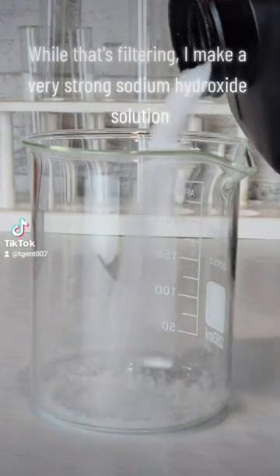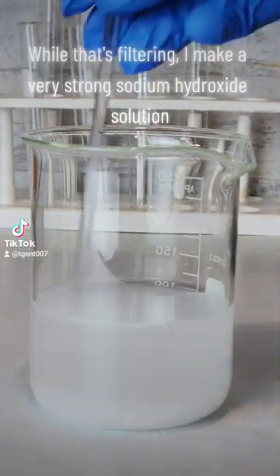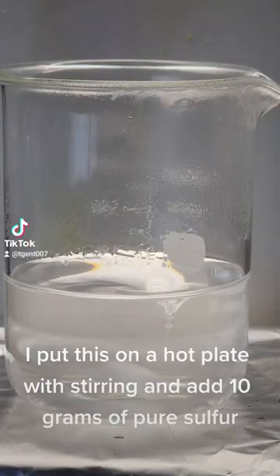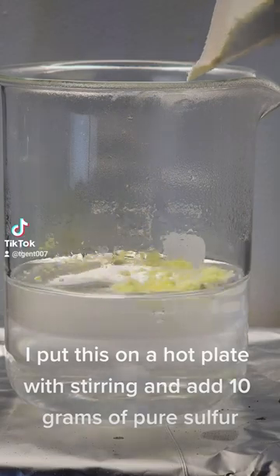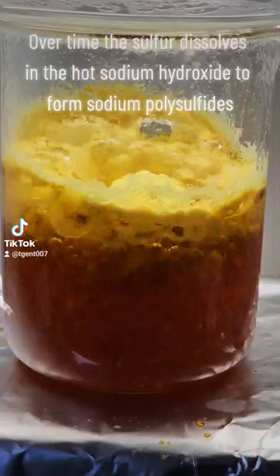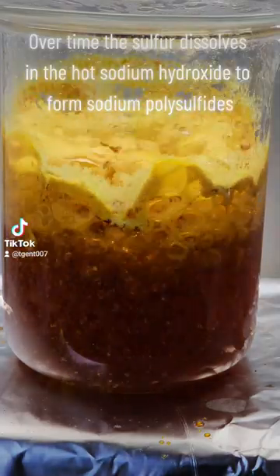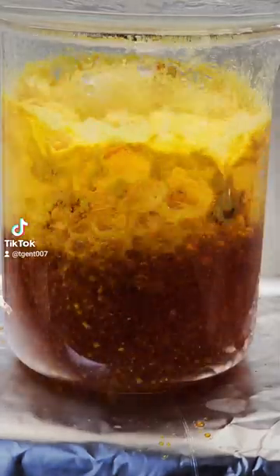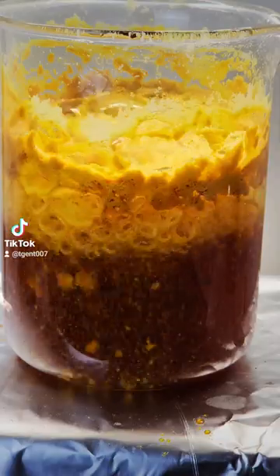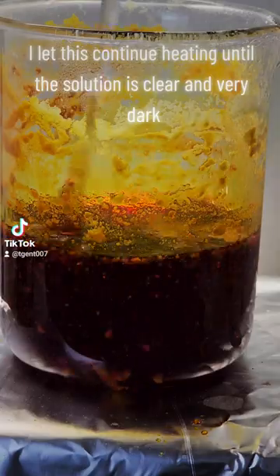While that's filtering, I make a very strong sodium hydroxide solution. I put this on a hot plate with stirring and add 10 grams of pure sulfur. Over time, the sulfur dissolves in the hot sodium hydroxide to form sodium polysulfides. I let this continue heating until the solution is clear and very dark.